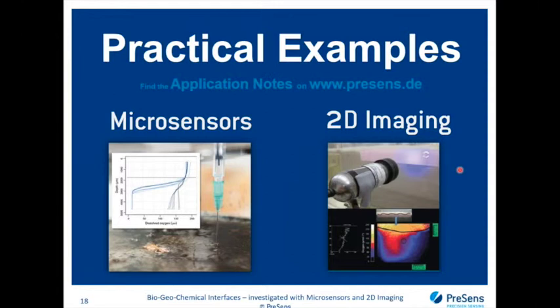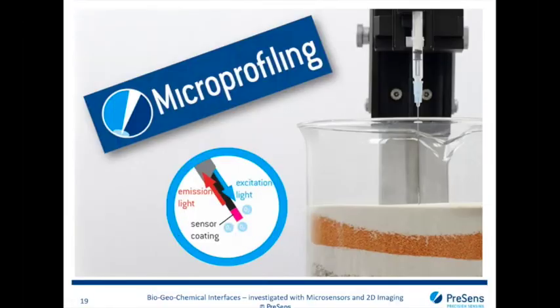Thank you, Robert. Okay, enough of the theory. Coming to some real practical examples where microsensors are applied, how would it look like? We see here a case where the microsensor actually penetrates inside the soil. In principle, again, it measures here at the very tip only. It detects the oxygen concentration, and by the emission spectrum back, we can directly correlate.